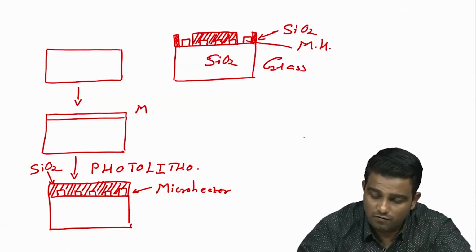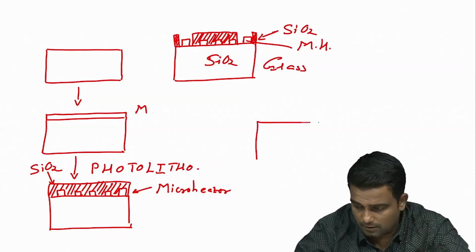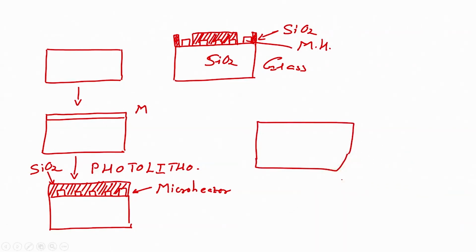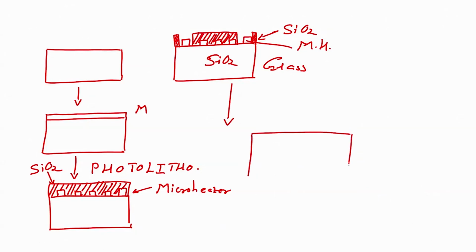Now, on this what will we have? Let us see the screen please. After this, we will deposit a metal.